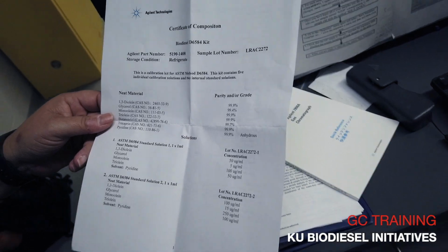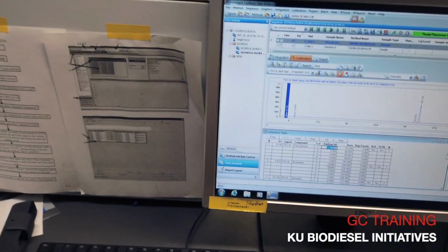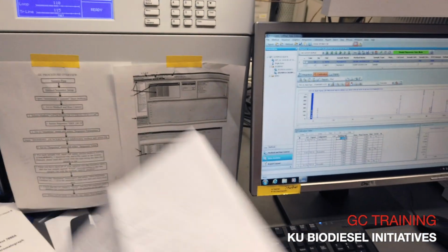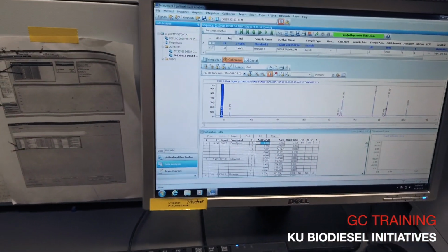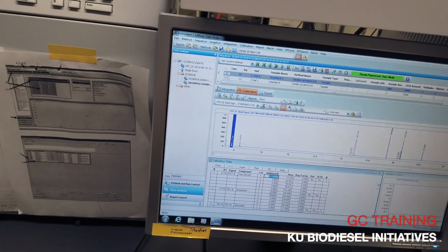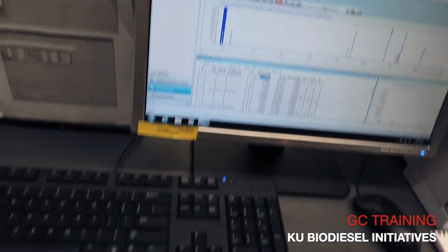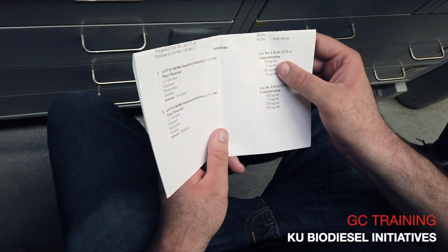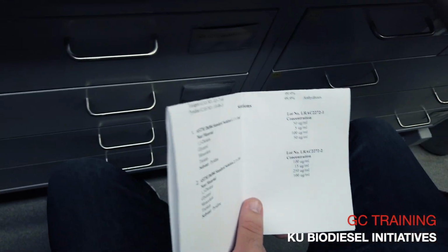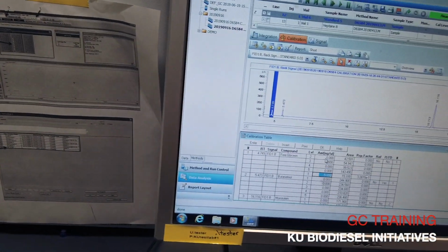So we have a couple options here. You can see that all the areas have been inputted. So there's a couple options for how we can do this. I think we can play around and see what numbers it'll spit out if we do it that way.